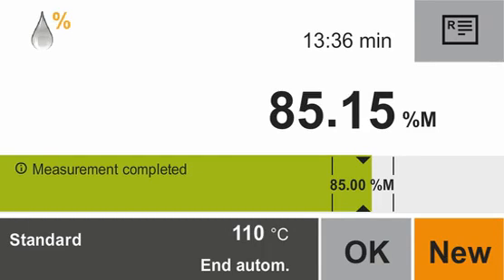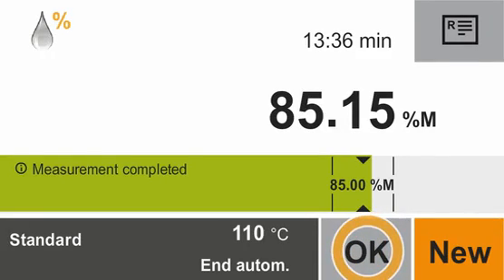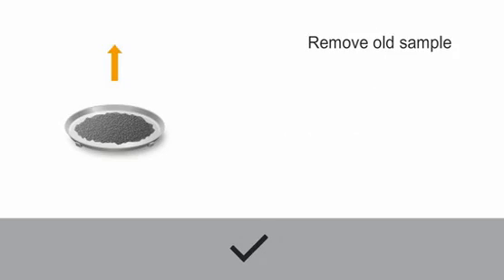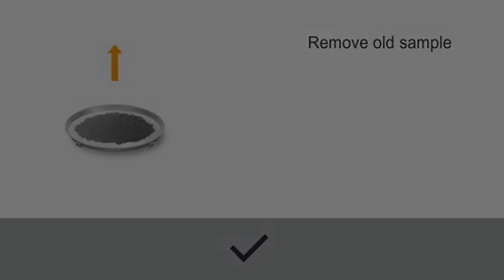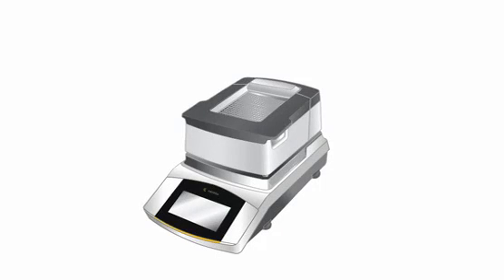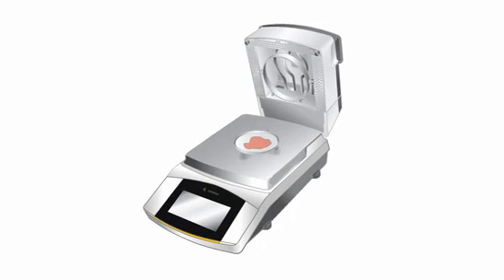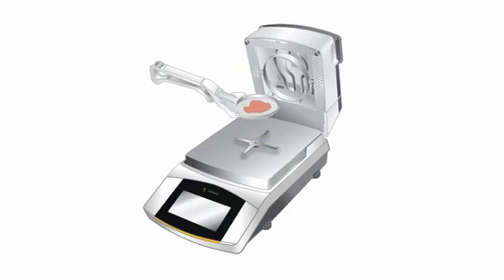Removing the sample. Confirm the completion of the measurement by tapping OK. In the display, you are now asked to remove the old sample. To do so, please open the hood and remove the sample pan. As the sample pan will be warm, you should use the sample tong for this process. You can discard the sample pan after it has cooled down.